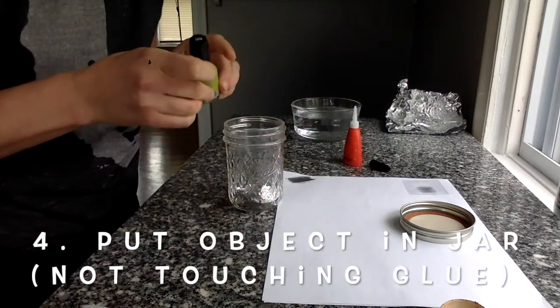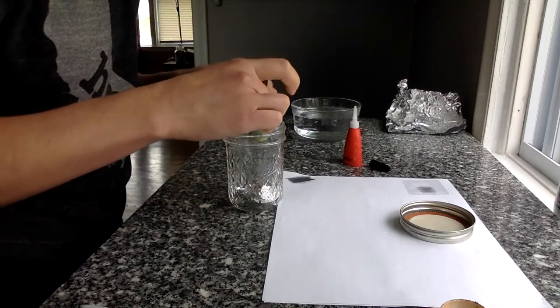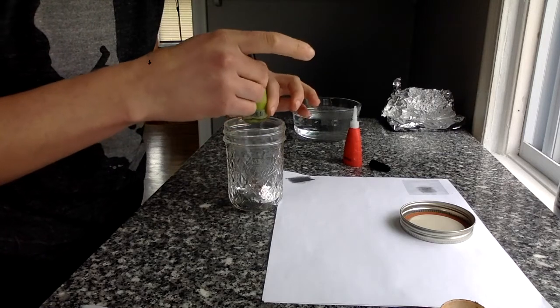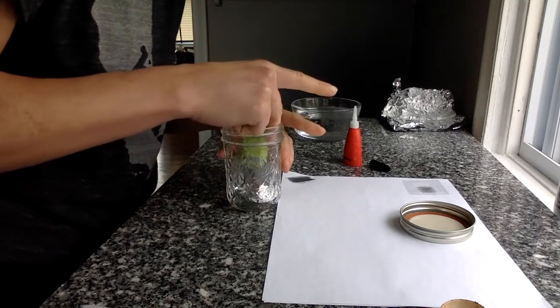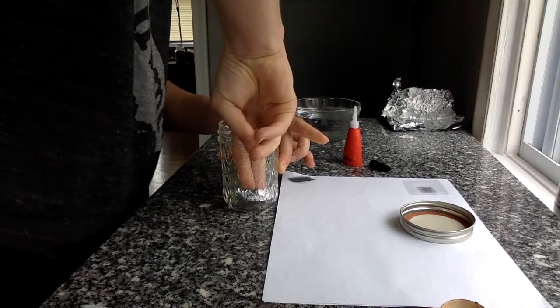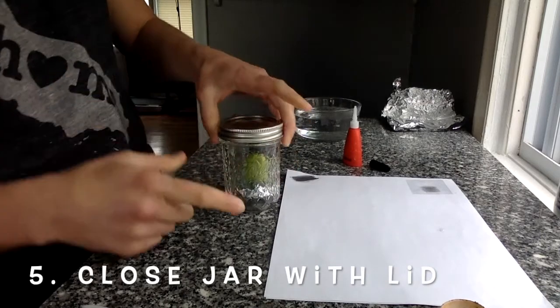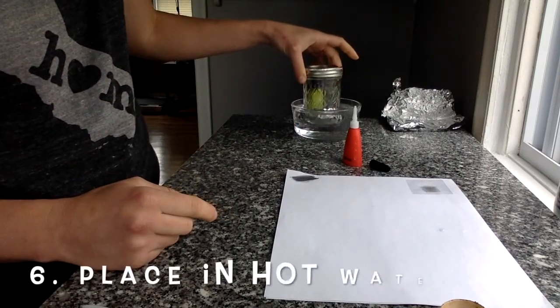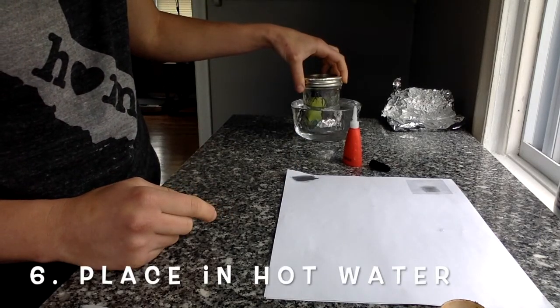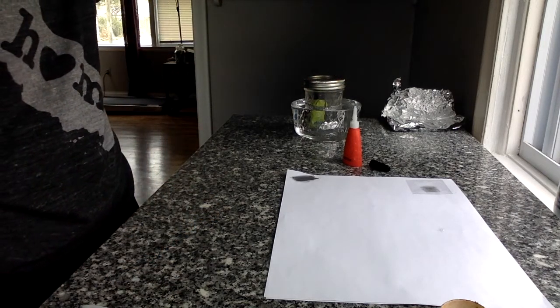You're going to take your object and stick it inside, but make sure that it is not touching the superglue. You're going to close up that jar and put it into your hot water. Just let it sit there for a couple minutes.